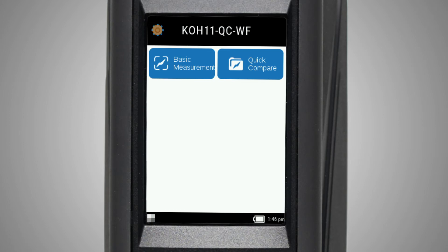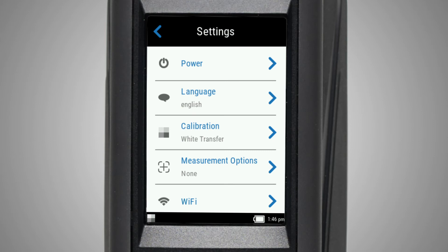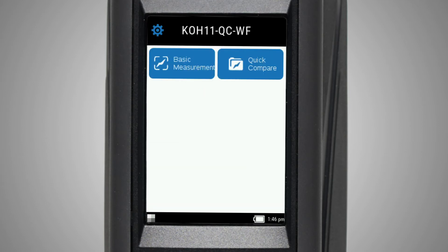At the top are settings. Here you will be able to set and edit the instrument's configuration options. More on these will be covered in the video on instrument settings. Below is the basic measure icon. This allows you to take quick measurements without comparing it to a standard.